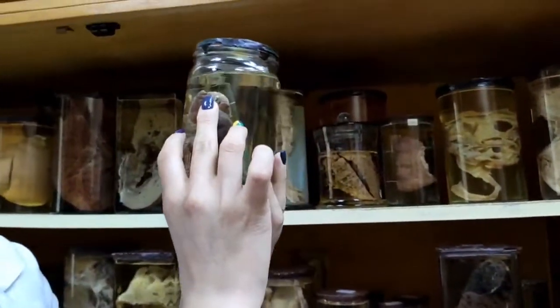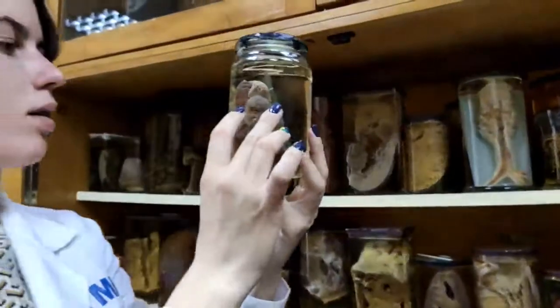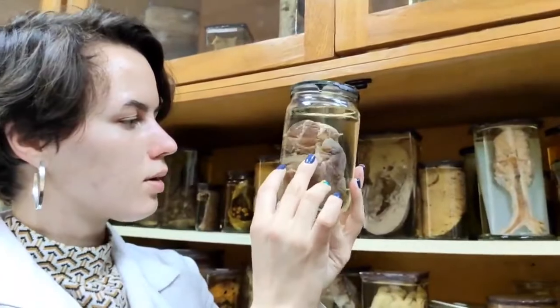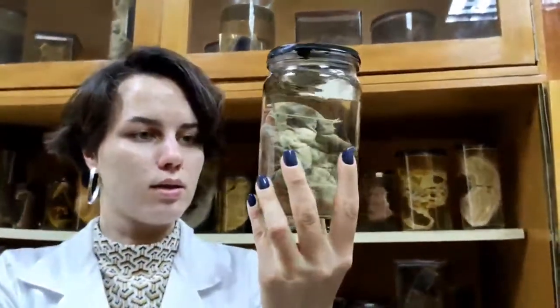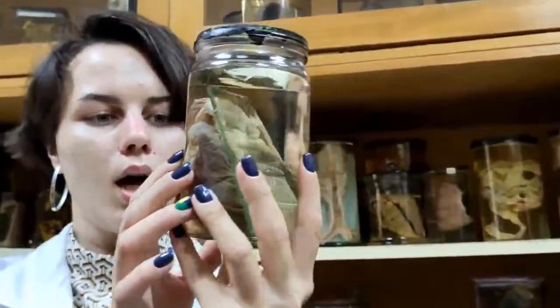Chronic obstructive pulmonary emphysema. Oh, really? Okay. I thought at first that this was polycystic kidney, but okay. Emphysema does not really look like lung at first look, but you should just remember it.